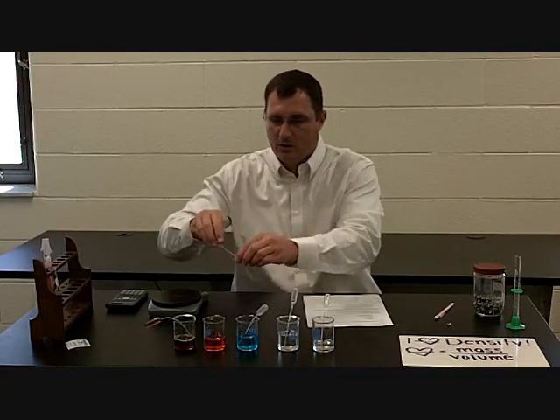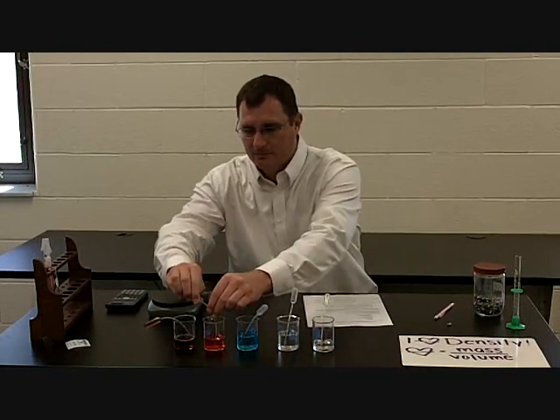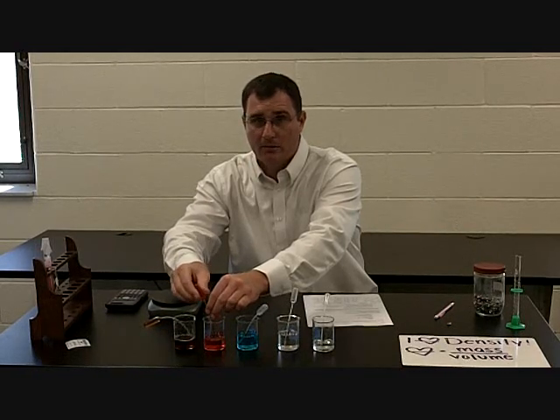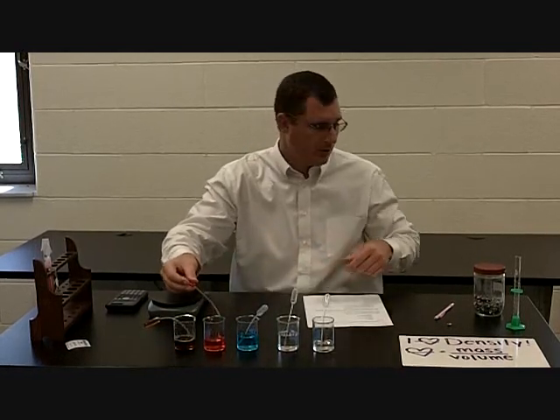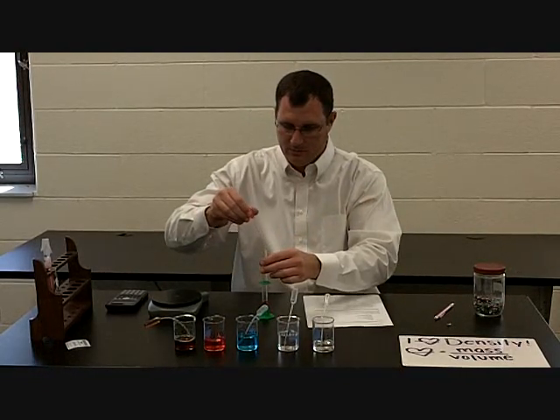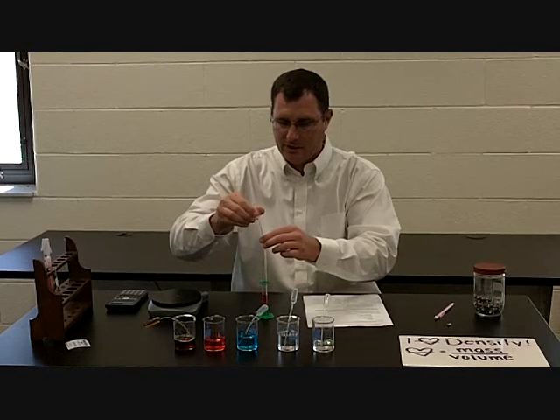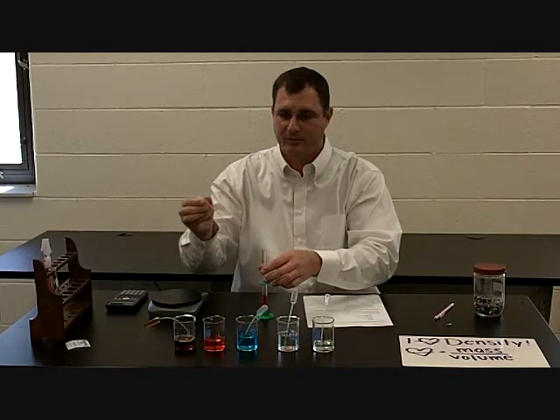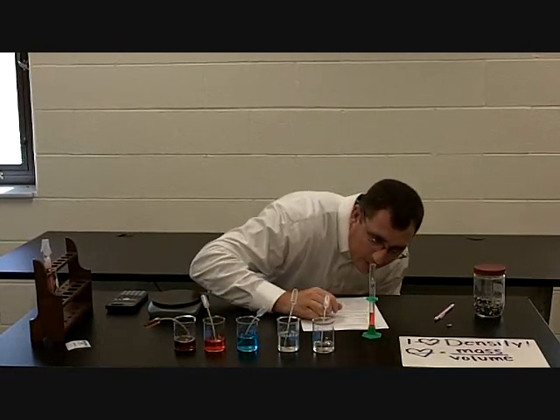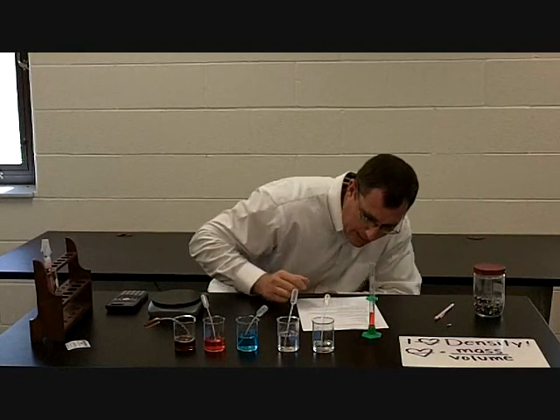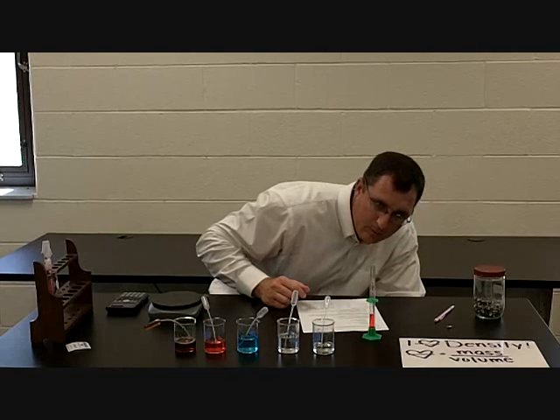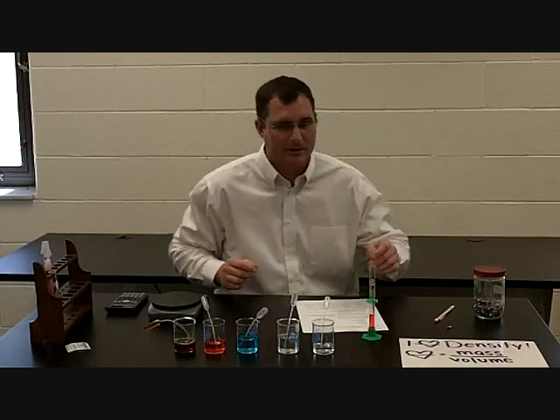Once we do that, we're going to fill our pipette again and calculate the volume of liquid. I'm going to take a graduated cylinder. This graduated cylinder has markings for the milliliter, so I have to estimate one spot. When I look at it really close, that is 4.8 milliliters.